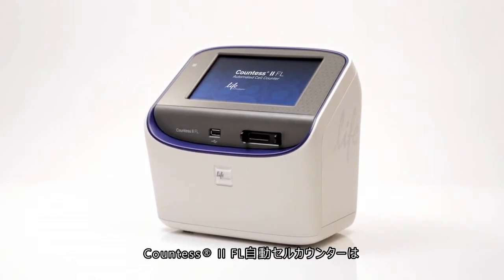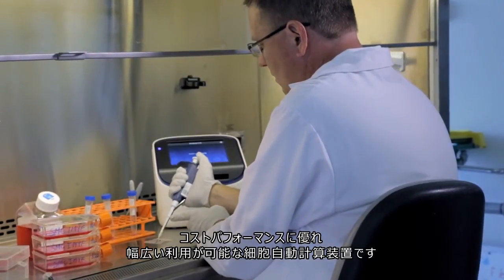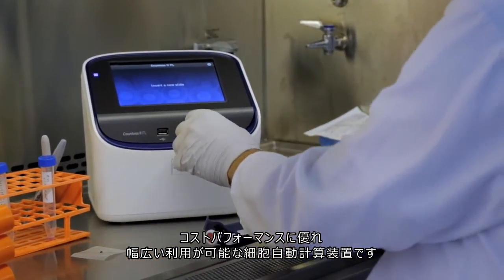Introducing the Countess2 FL automated cell counter. The Countess2 FL cell counter gives you the flexibility to fit your cell counting needs and also your lab budget.